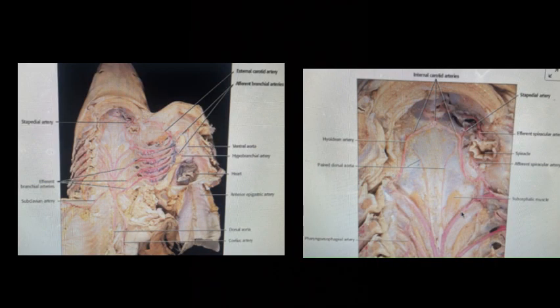Next, I will be talking about systemic circulation in the dogfish shark. Blood becomes oxygen rich in the capillaries once it goes through the gills through countercurrent exchange, and is collected by four complete collector loops called holobranchs, and also one called the hemibranch. A collector loop will sit around an internal gill slit while consisting of different branches.